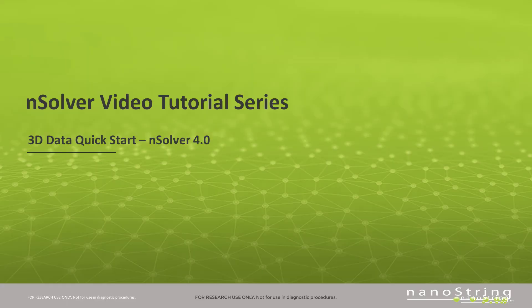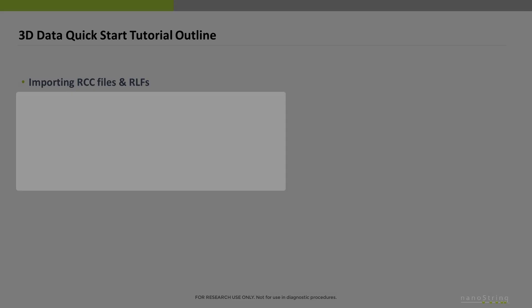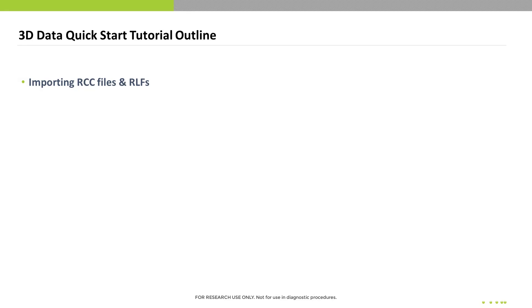Welcome to the NSOLVER video tutorial series. This video covers the 3D quick start to analysis. We'll first cover how to import both RCC files and RLFs.